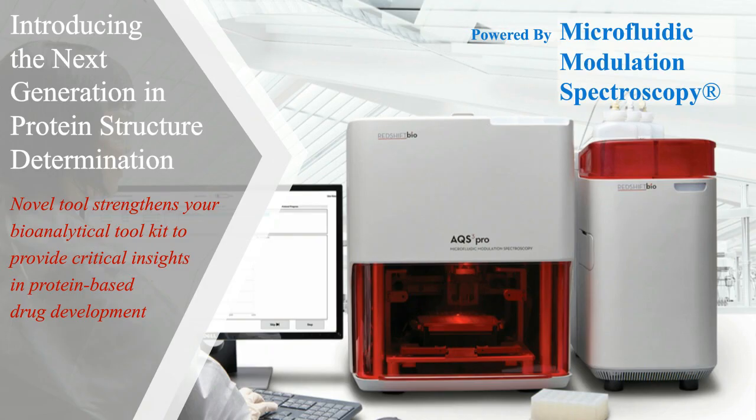Here we can see an image of the AQS3 Pro. As you may note, the system comes in two halves. The larger unit in the middle is the analytical unit, and at the bottom you can see the autosampler, from which the system takes your samples from 24 or 96 well plates and runs them through the system, through the laser and the flow cell, which are contained at the top half of the larger unit, and the flow cell of which is user interchangeable.